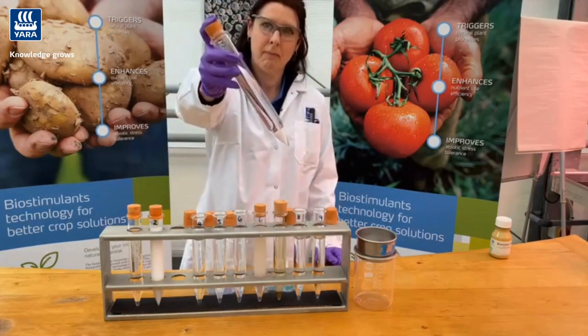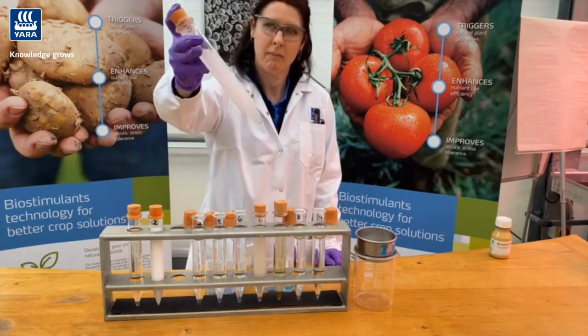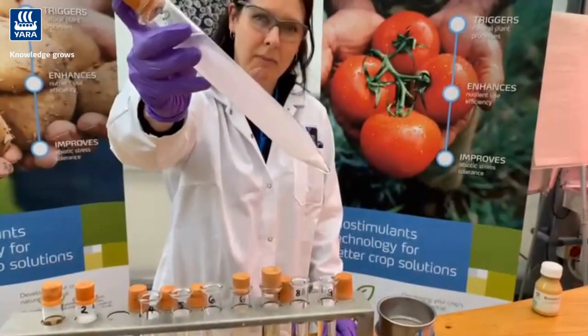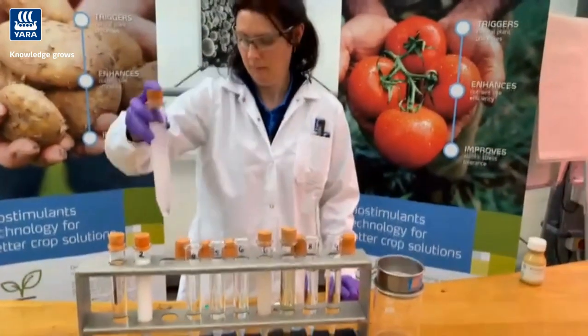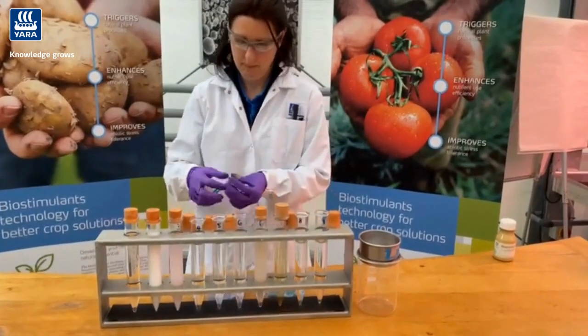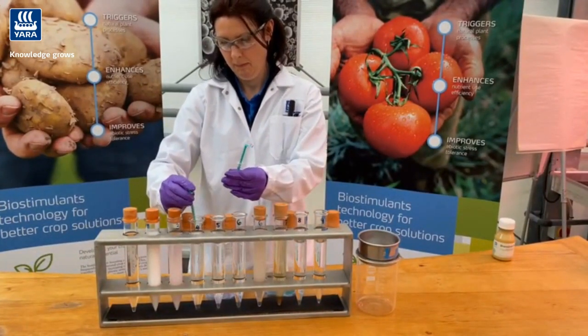However, this next mix we class as non-compatible, because as you can see, even when we agitate, it immediately settles out. So we would class that as a non-compatible tank mix. So that's the difference between compatible with agitation in test tube number 2, and test tube number 3, non-compatible.